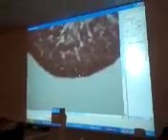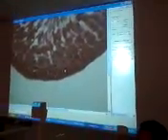Okay, so these guys out on the edge here should be your spermatogonia. So basically these are your stem cells. These are the dividing cells that are diploid that divide to become primary spermatocytes. If you look a little bit further down, you'll see these cells where you can make out chromosomal material. It's a little better on the microscope, obviously. Those should be primary spermatocytes, and they're actually in meiosis at this point.